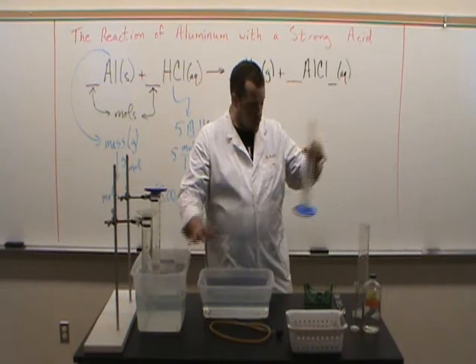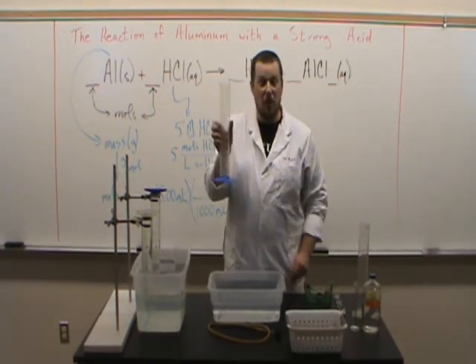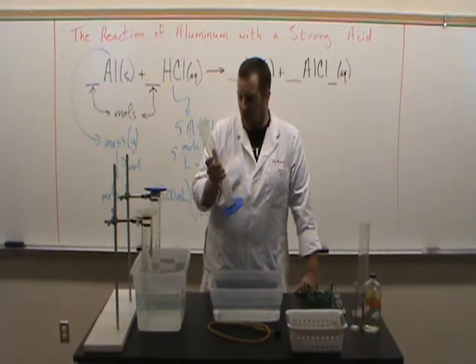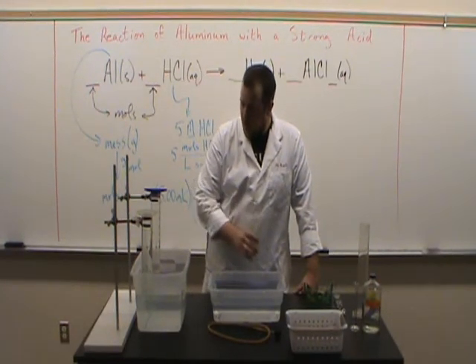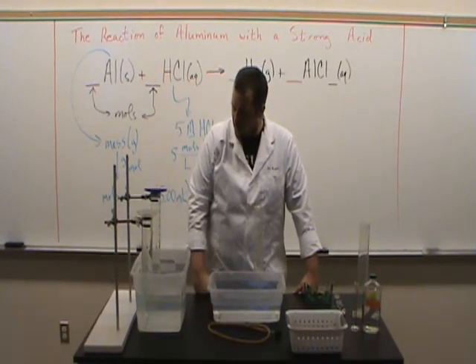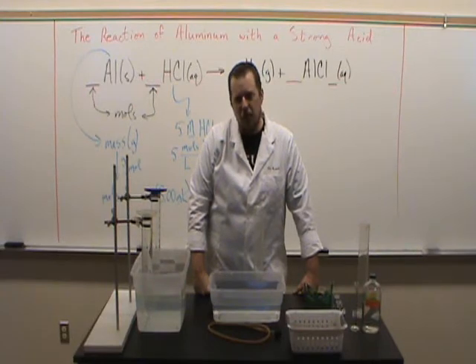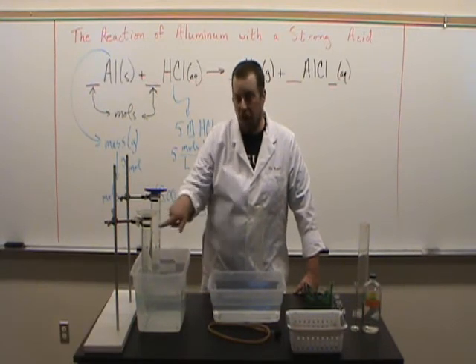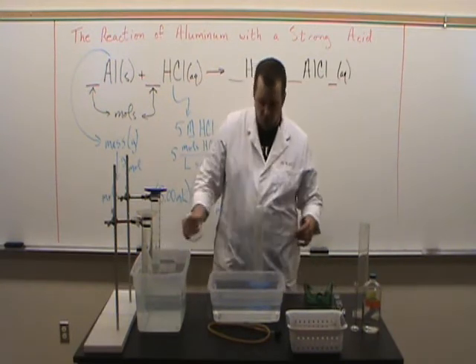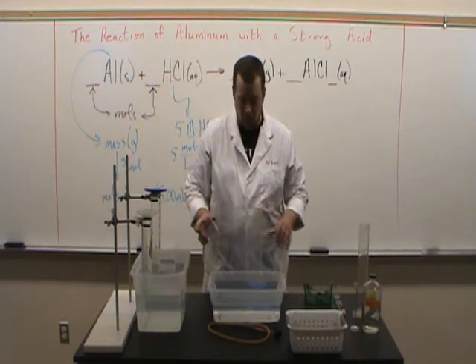So we can use a graduated cylinder. In this case, we need a fairly large graduated cylinder. But how do we get this little magic trick to happen? I've got a couple of these set up over here already. How did I get those upside down? These are both full of water, and they're upside down, and they're not emptying up. Well, you've probably done this at the pool, but you didn't think about it in terms of a chemistry experiment.